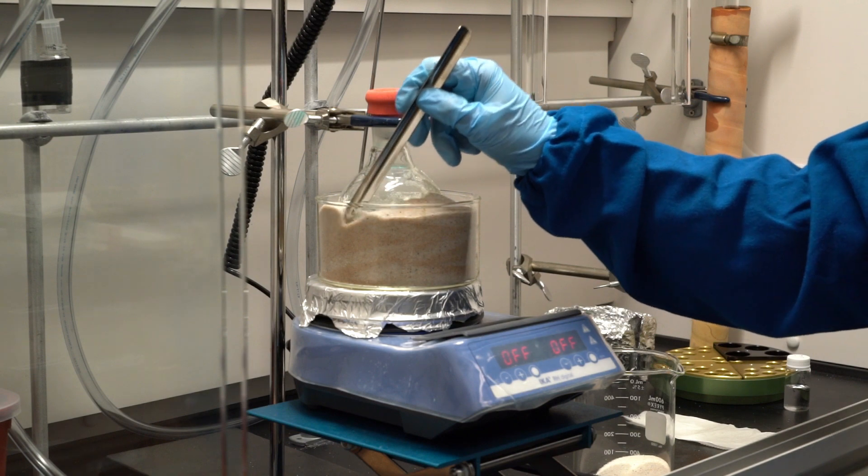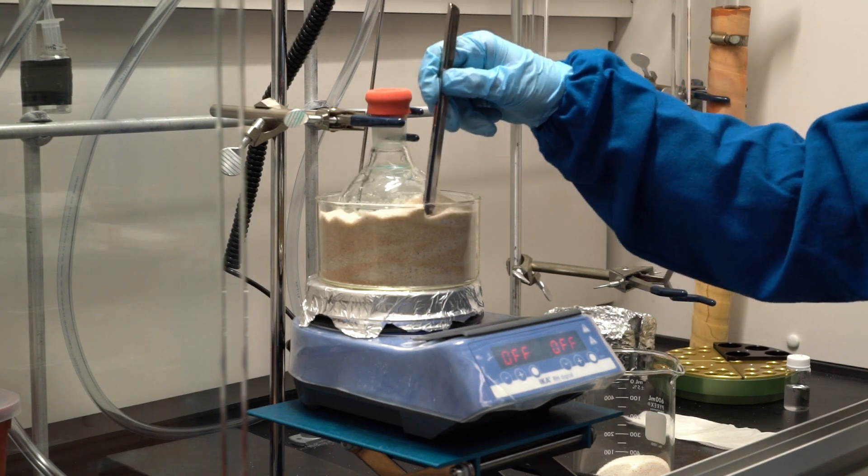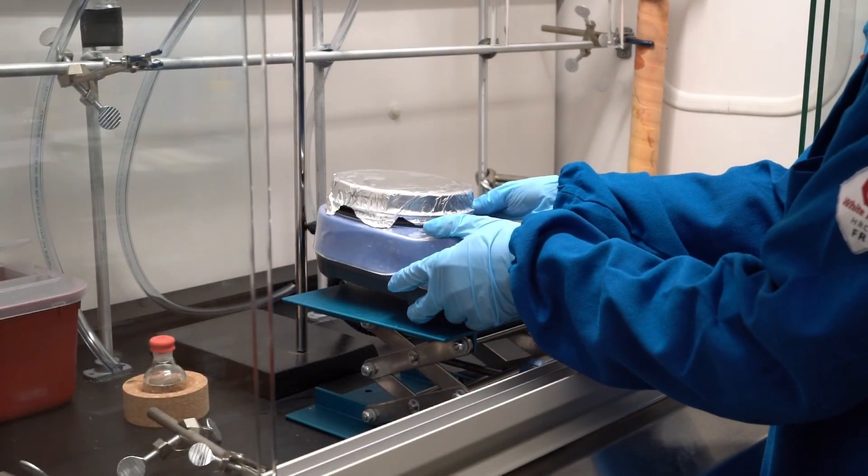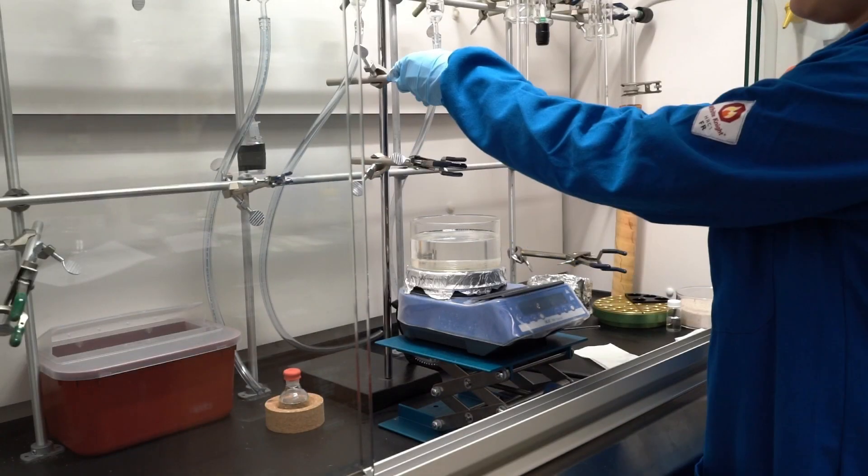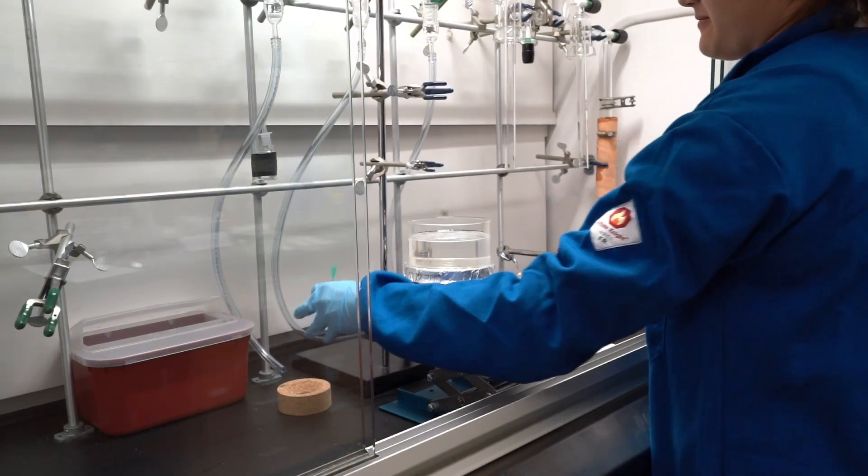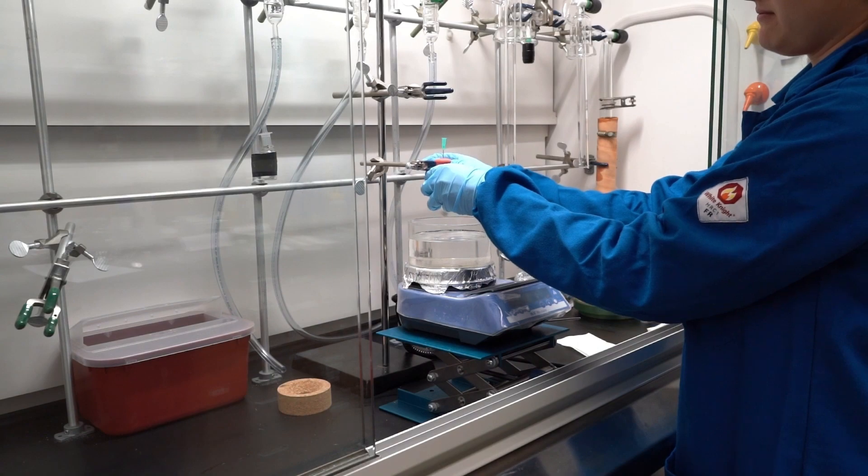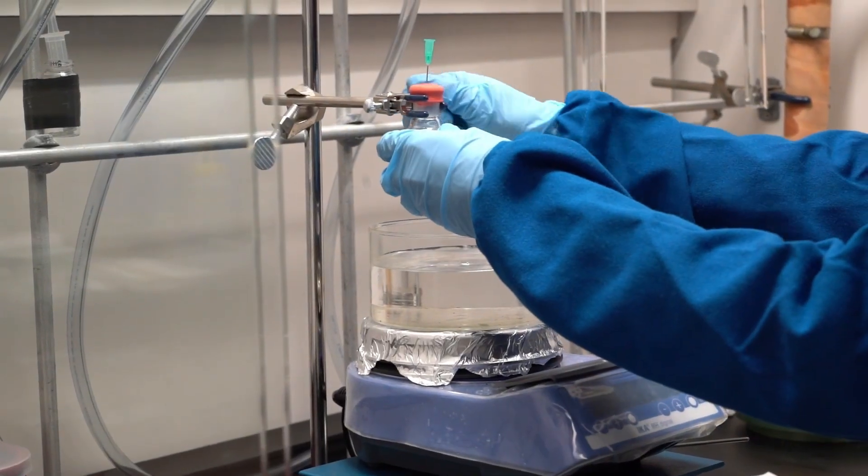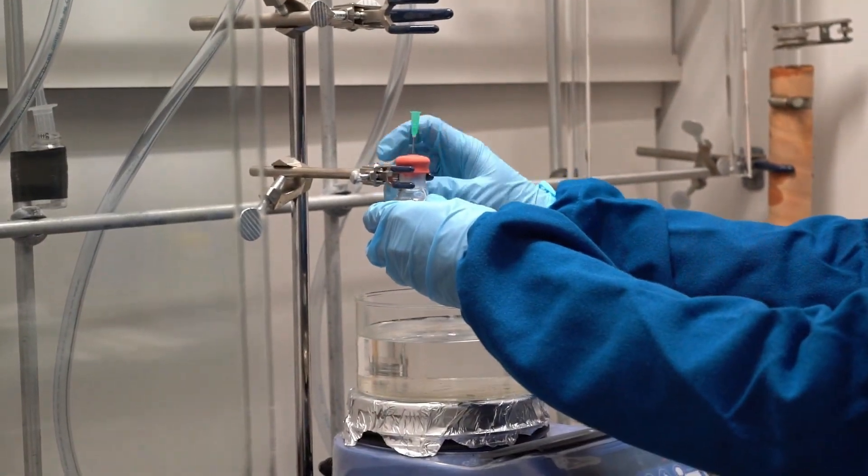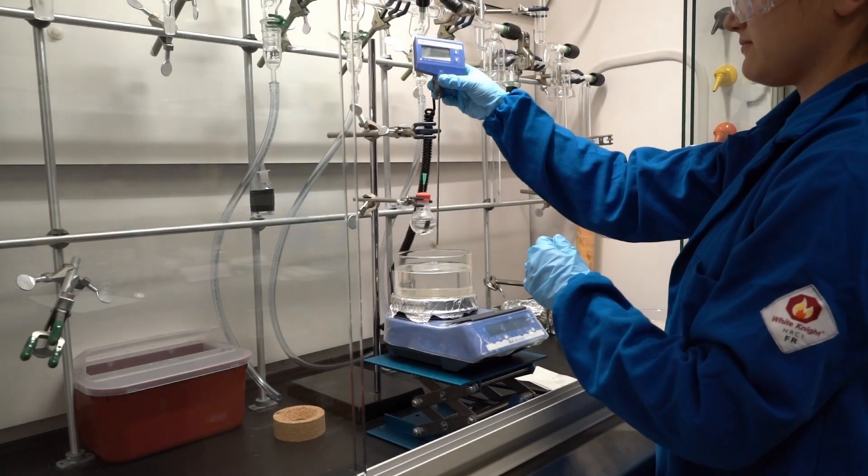When setting up an oil bath, we place a lab jack beneath the hot plate. A crystallization dish or any metal container can contain the oil. After that, clamp your flask and a thermometer that is appropriate for your reaction temperature.